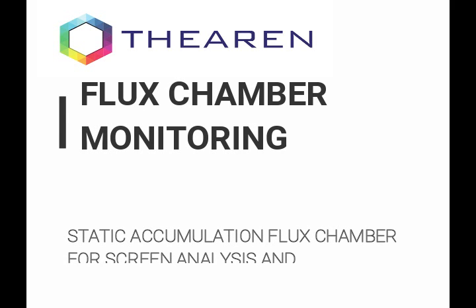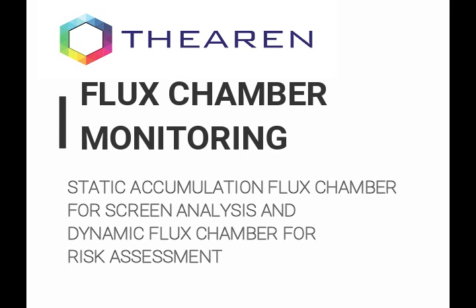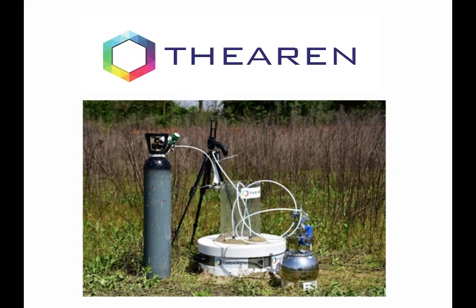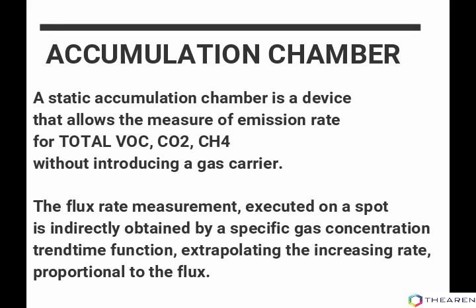The migration of volatile organic and inorganic substances from subsoil to the atmosphere is an effect of contamination of soil or groundwater. A flux chamber is a device used to measure vapor flow rate directly, excluding external or background concentration of the ambient air, and mitigating weather conditions at the outskirts. Now we'll speak about the accumulation static flux chamber for screening analysis, and after, dynamic flux chambers.